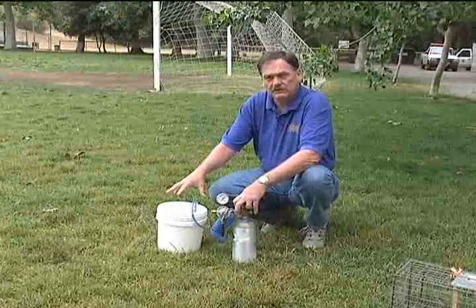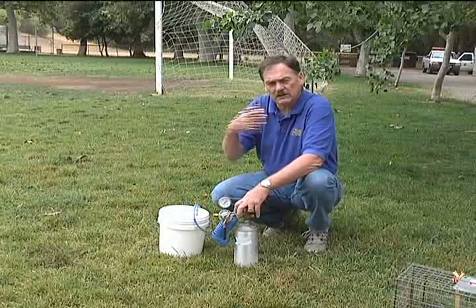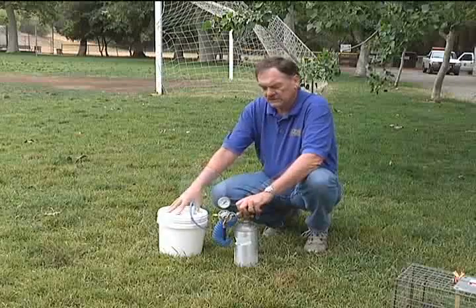You just need something that will accommodate the trap that the animal's in, because that's what we want you to do — put the whole trap with the animal in the container and close the lid.